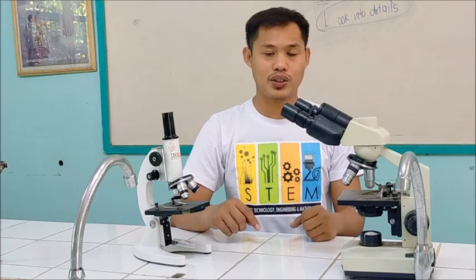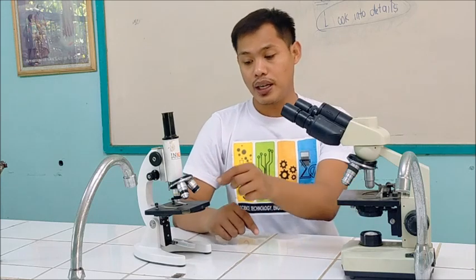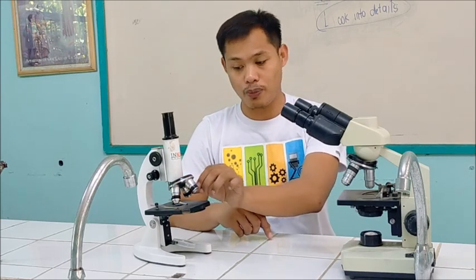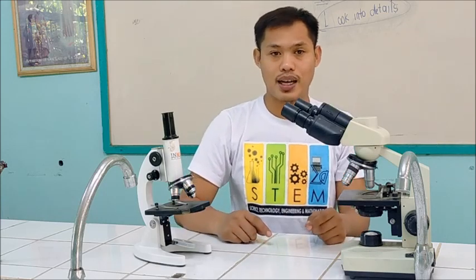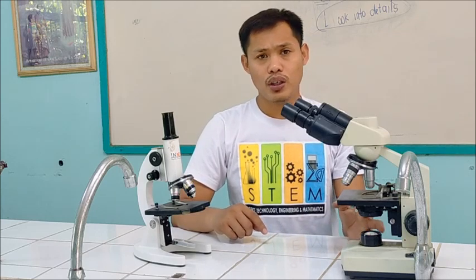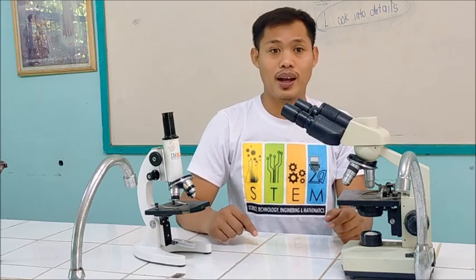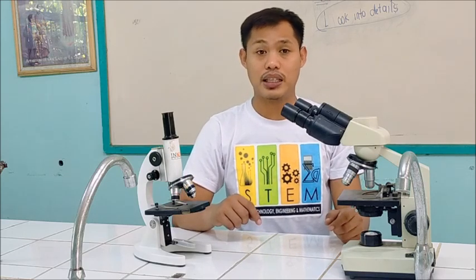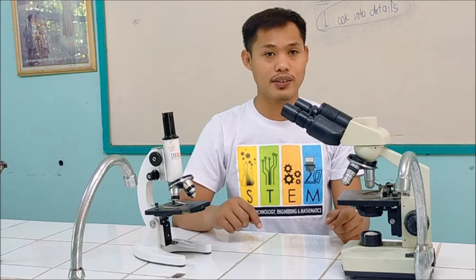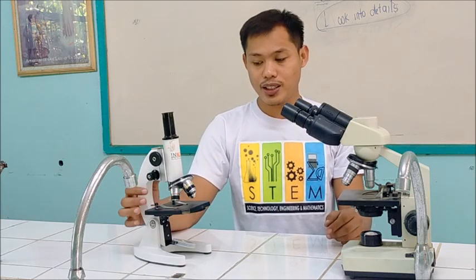In order for us to differentiate these objectives, we can look at the band on each objective. If we see a red band, it simply means that is the scanner. If we see a yellow band, that is the low power objective. If we see the blue band, that is the high power objective. Now, a binocular microscope contains four objectives, and what is the missing one? We have the white band, which is the oil immersion objective. Take note that if we are using the oil immersion objective, we need to use cedar wood oil or simply oil itself.